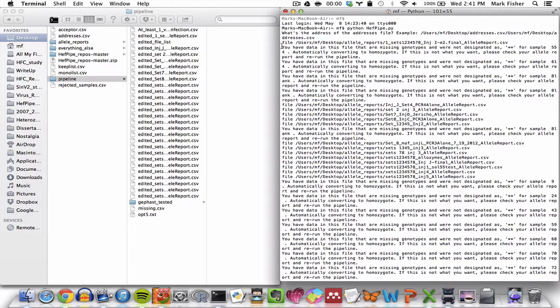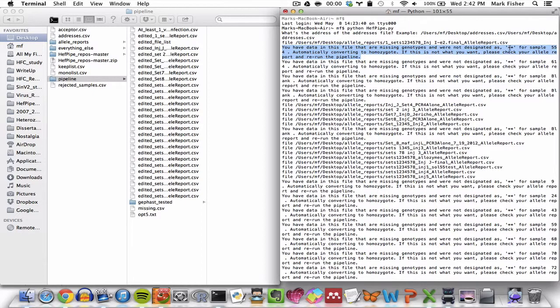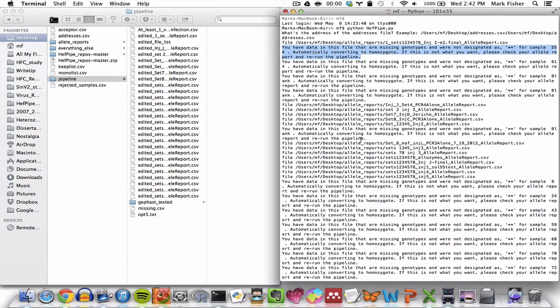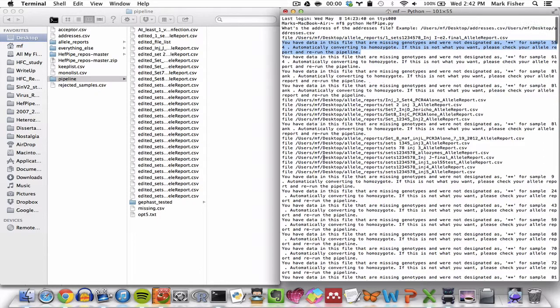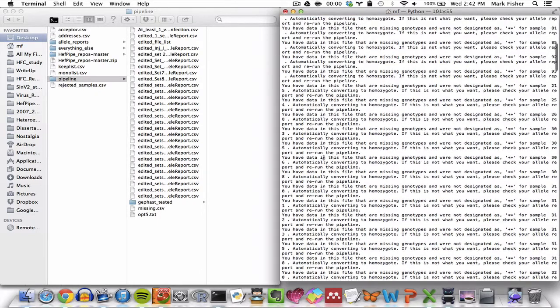But first let's take a look at some of these missing data flags. So in the first allele report file that gets processed, you'll notice that sample 554 is missing a genotype and the missing genotype stand-in, the double asterisk, is also missing. So it assumes that that's a homozygote and it automatically converts that genotype to a homozygote. If that's not what you want, you have to go back to the allele report and edit it and change it to what it actually should be. And again, this holds true for all of the different allele reports as they're getting processed.